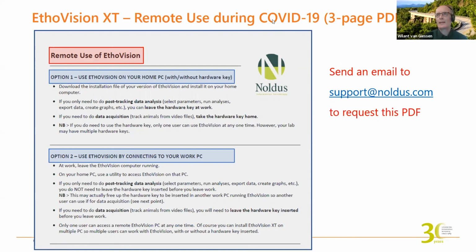Well, you get data for velocity. It's going to give you a number for velocity: mean velocity, maximum velocity. You don't actually set a velocity. I guess you can analyze velocity per time bin if that's handy. Jason, is that how you do it?